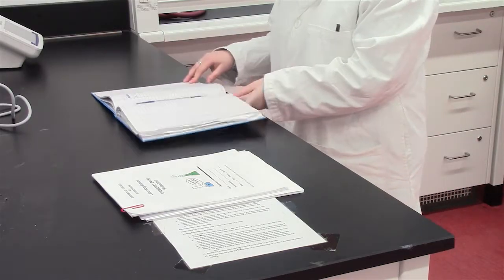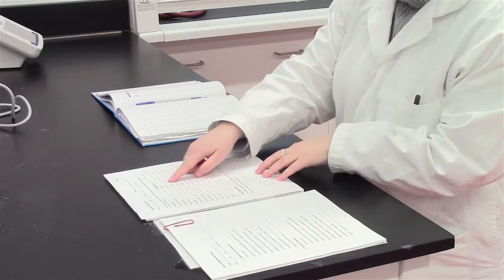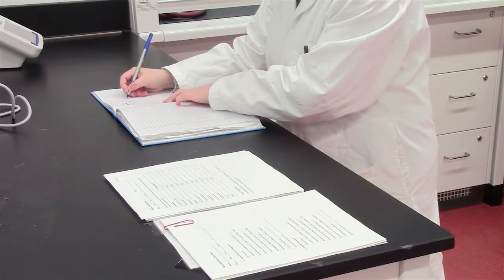After finding your melting point value, proceed to compare it with the documented known melting point values. This will assist you in determining what compound you have.